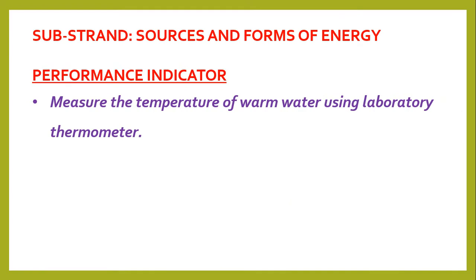We are still under sources and forms of energy, dealing with our last indicator. By the end of the lesson, you should be able to know how to measure the temperature of warm water using laboratory thermometer.